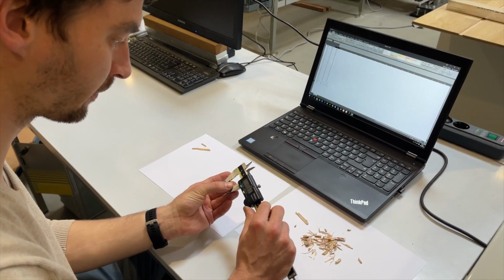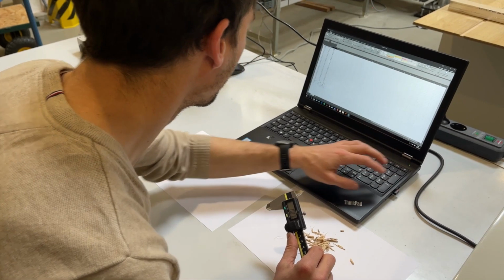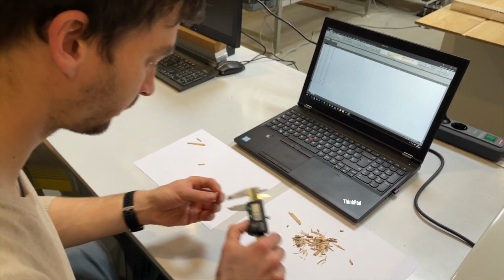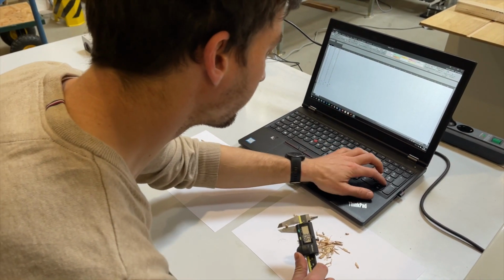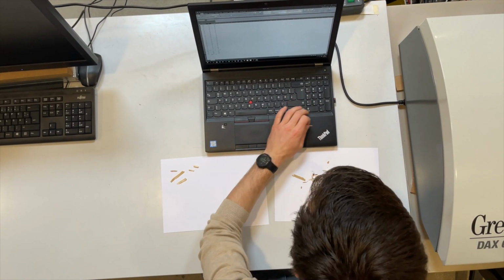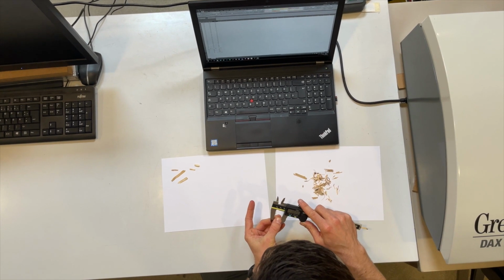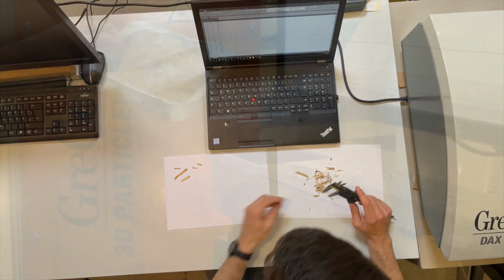Another method is a manual measurement of the particles. This method is also very time-consuming and only a small sample can be examined. Moreover, the operator's influence on the measuring results plays a role here. Due to the efforts involved and the possible measuring errors, both methods are only suitable to a limited extent to supply sufficient and reliable data to optimize the particle properties.